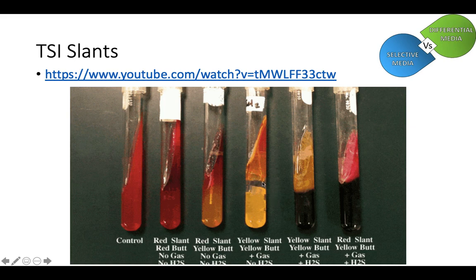That particular species of organism was not able to produce gas, but this one is. So that's something different. It's another little bit of information that you can get. And gas production can occur in any of these, by the way.